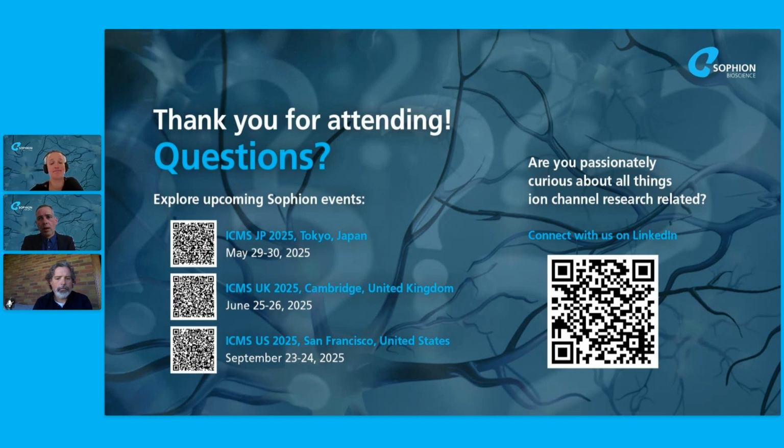So that would be my recommendation. And Enoch, if you need any information on that Miltenyi cell sorter, just get in contact, because we've been using it in our labs for probably 2 or 3 years now, and it's probably, as Kadla suggests, one of the most gentle, and yet it does a good job of sorting without, as you say, these compromising cell sorting issues that you can face with less gentle cell sorting.